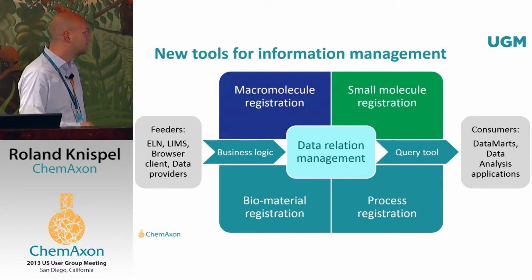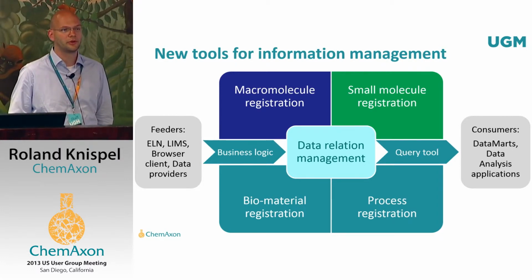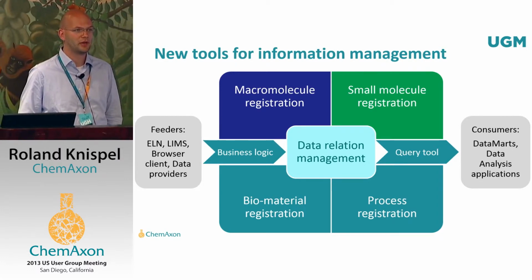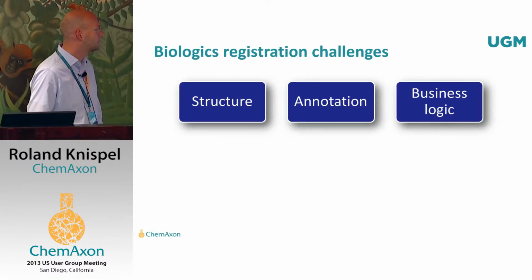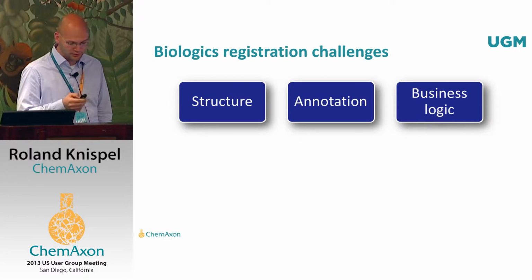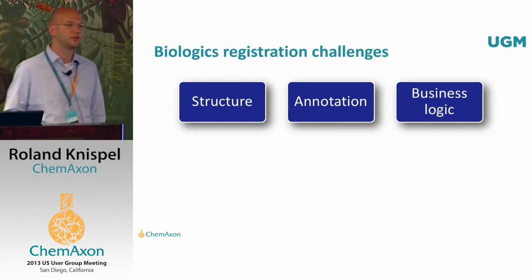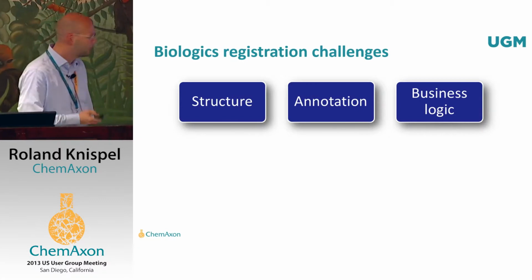And what we've recently been doing is developing a registration module for the structure of macromolecules, which is based on HELM notation. I'll just spend a few words on this. So, summarizing, biological registration challenges are in fact threefold.